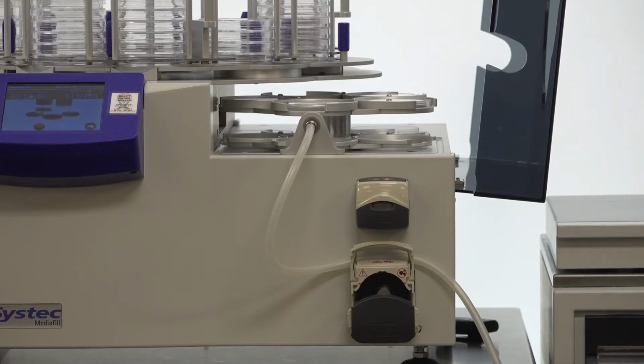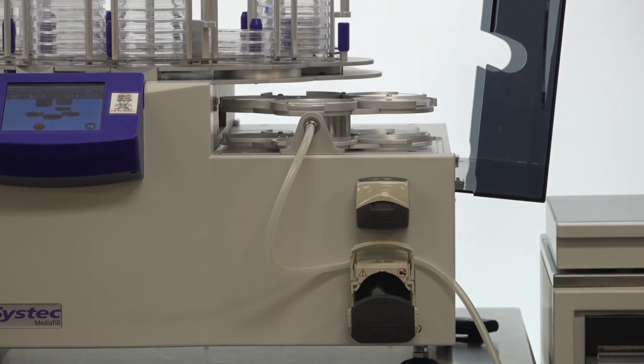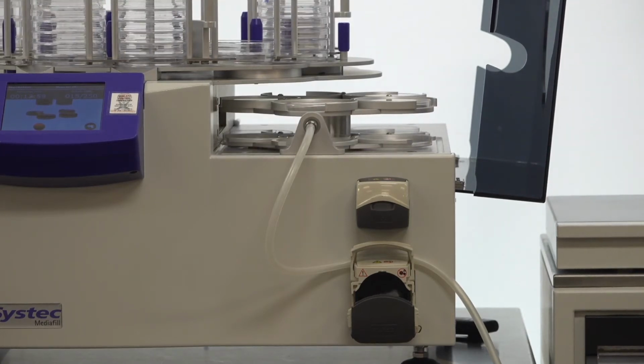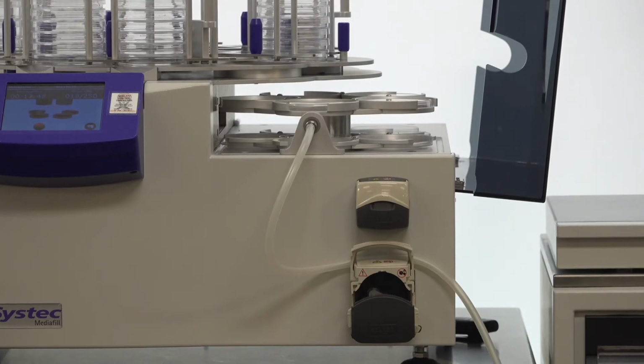The system can be programmed for us to be able to say how much volume we have inside of our MediaPrep system, or we can say that we want to dispense up to 250 plates. Once those 250 plates have been completed, the unit will pause. As I have it running now, anytime it finds an empty column, the plate pour will stop. So it will pause after.